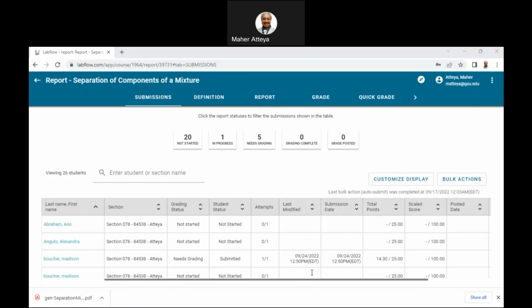So we just show you the whole thing, just to show the students where it is. So here it is. Edit, copy it there, and here it is.